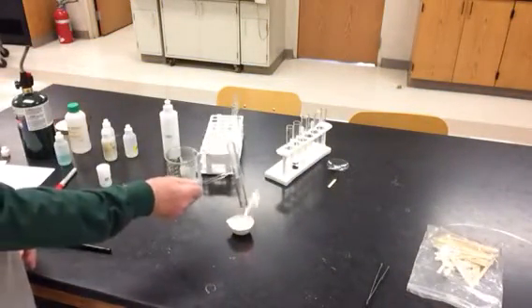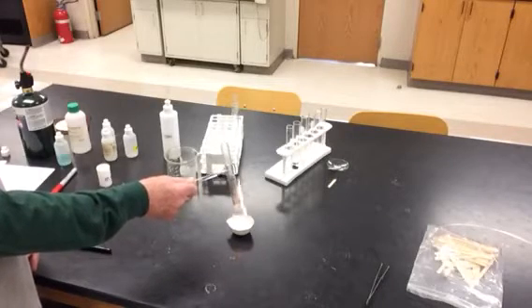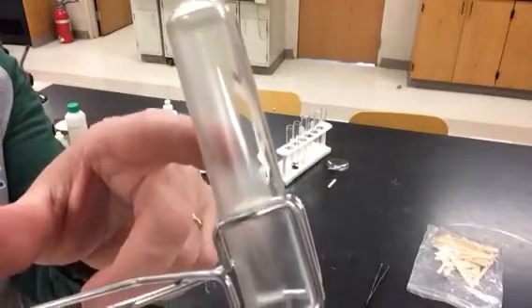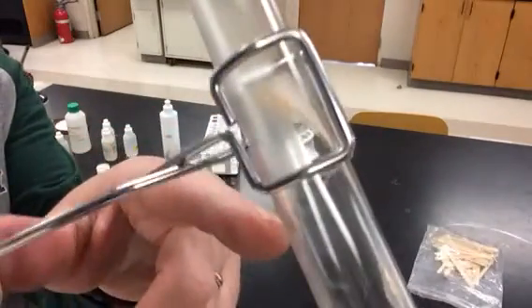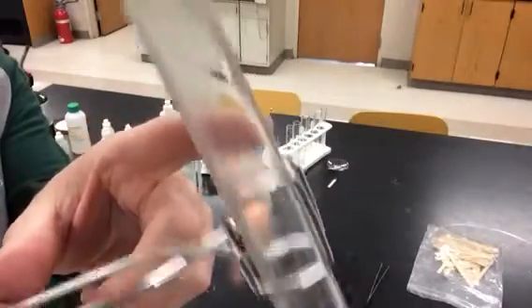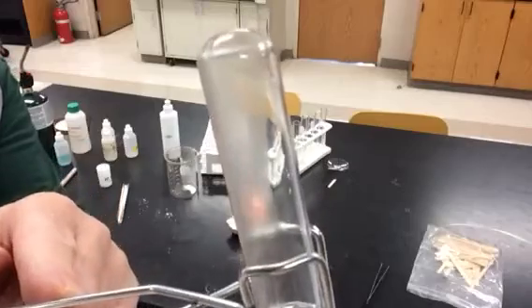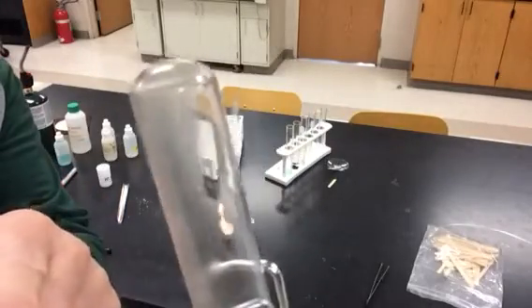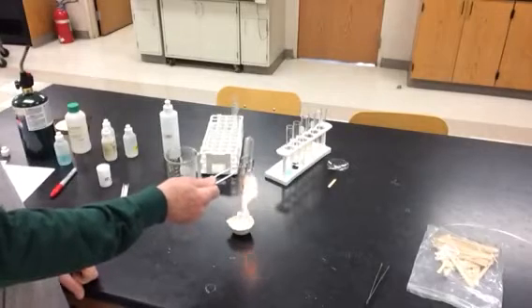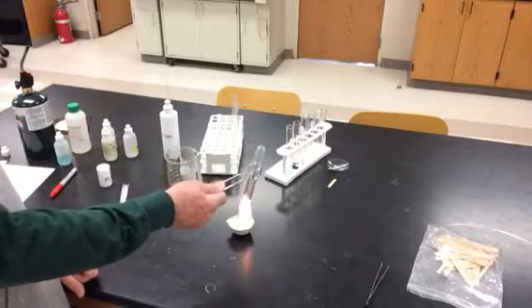All right, so I'll get a little bit more in here and then I'll hold the test tube up. Can you see evidence of fog in there, moisture, droplets? Okay, I think you can see that a little bit. I can see it a little bit. Hopefully you can too, see a little evidence of fog and moisture droplets there. So that's indicating that we've got some moisture, water being produced.